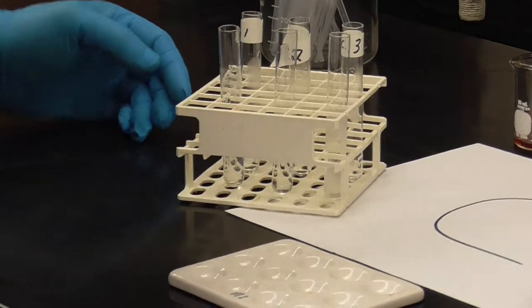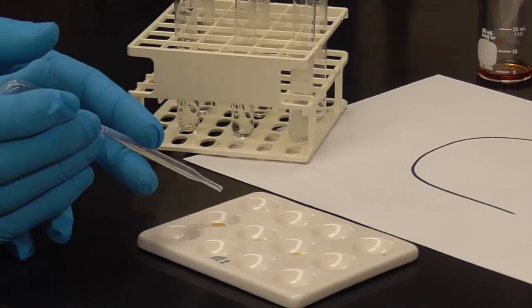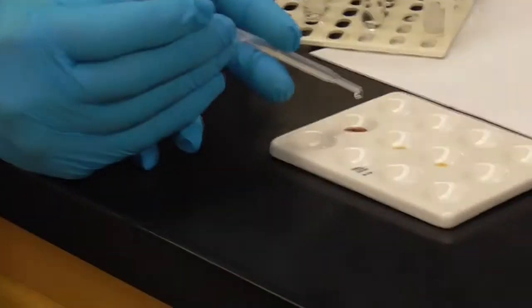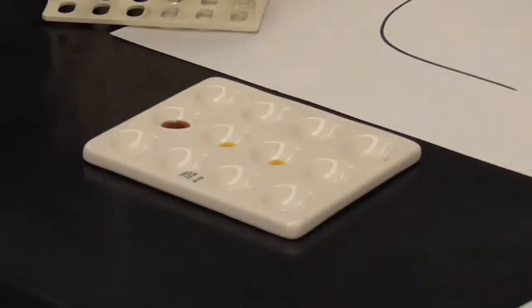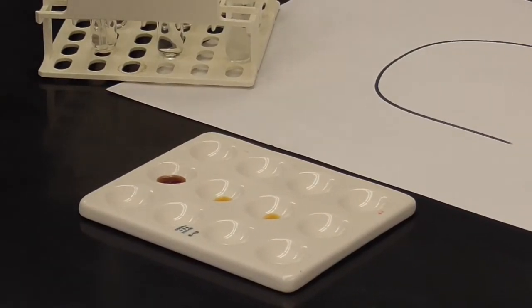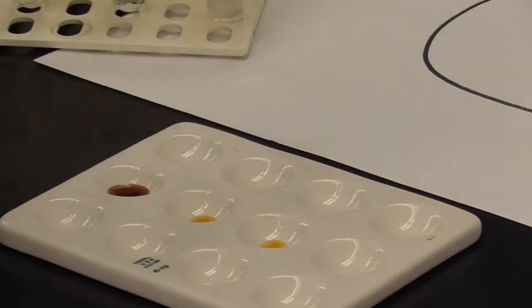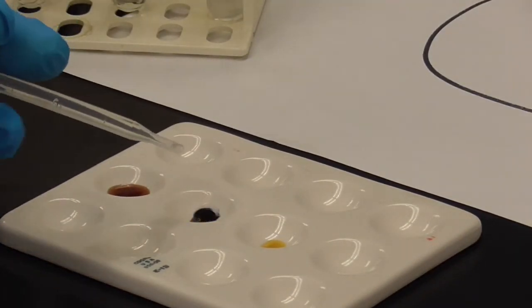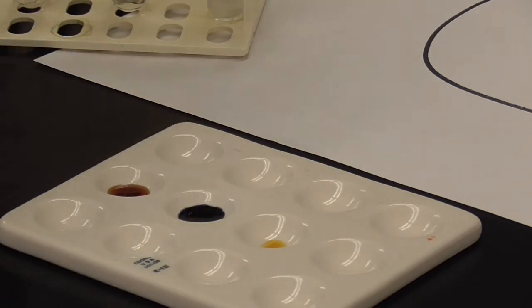And we'll, as usual, put 4 drops in 3 spots on our plate, and we'll see how well these enzymes did. So, tube 1, where it was at 37 degrees body temperature. 1, 2, 3, 4. Just like that. Not dark blue, so clearly that enzyme was doing something. Tube 2, which was at 100 degrees temperature. 1, 2, 3, 4. Dark blue. That enzyme did nothing.